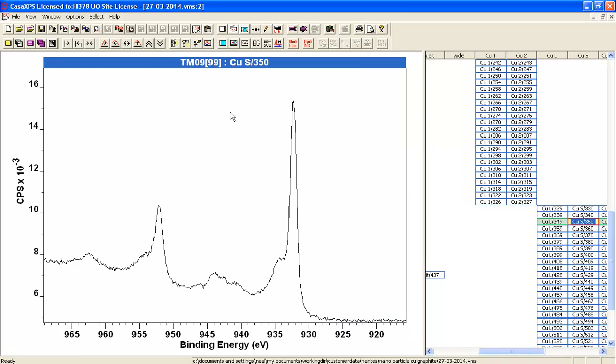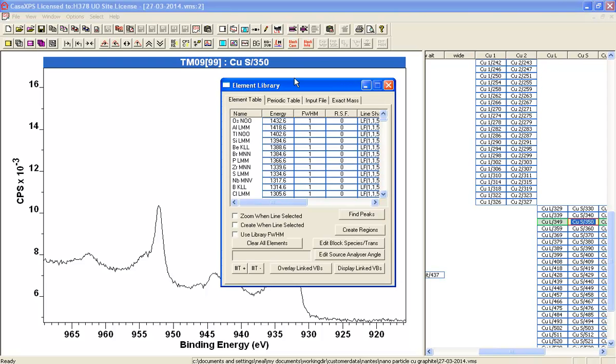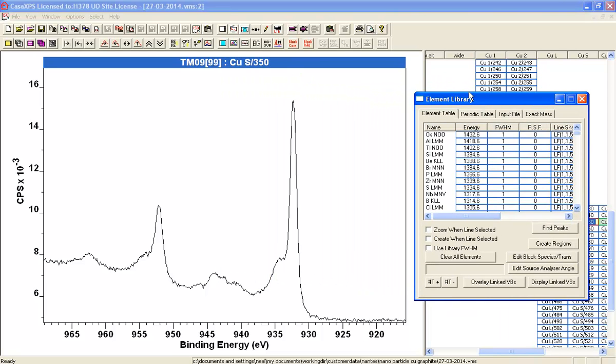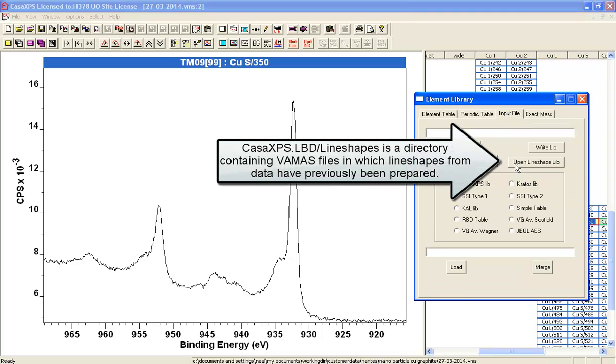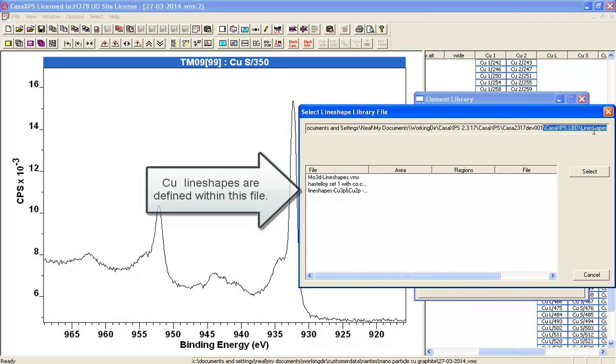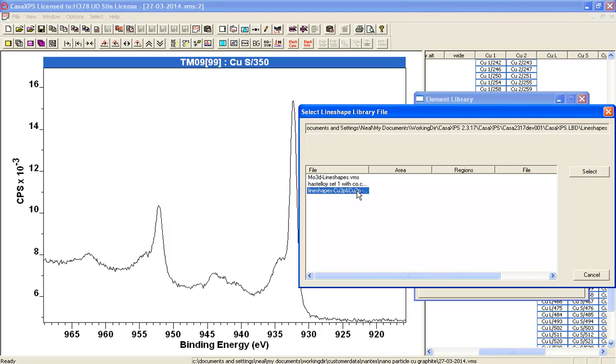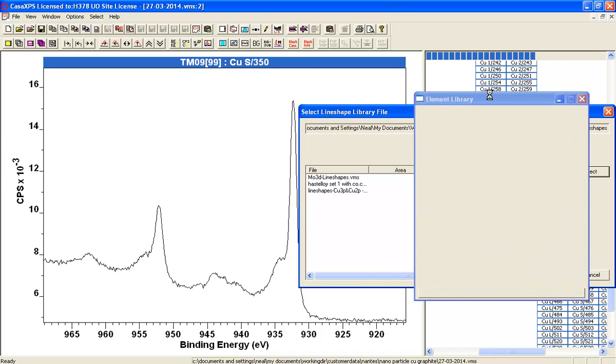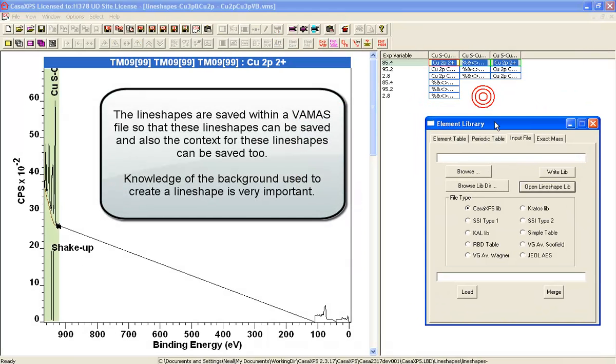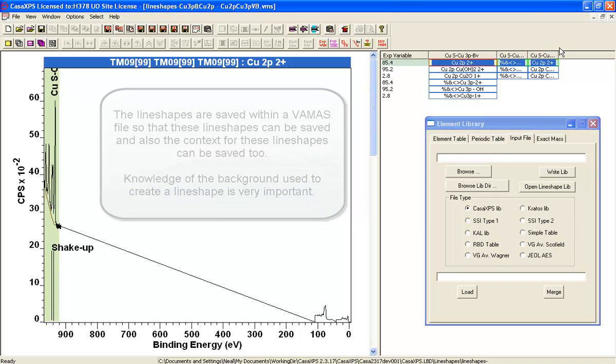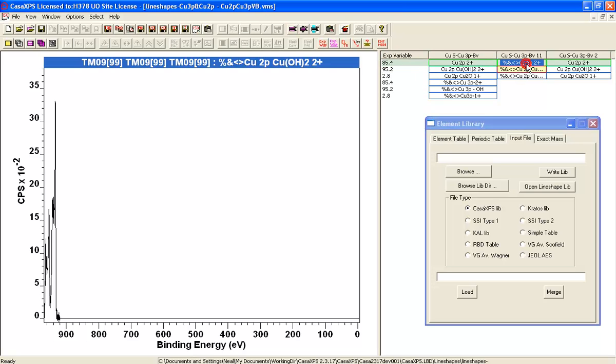And what I've done previously is I've prepared within the element library some standard line shapes that have been derived previously. And they've been saved in a directory that when I select open line shape, and this is the directory you can see, it's in the CasaXPS.lib line shapes directory, and I've prepared a file which when I select and I open, loads into the current session a set of line shapes that have been derived from data.